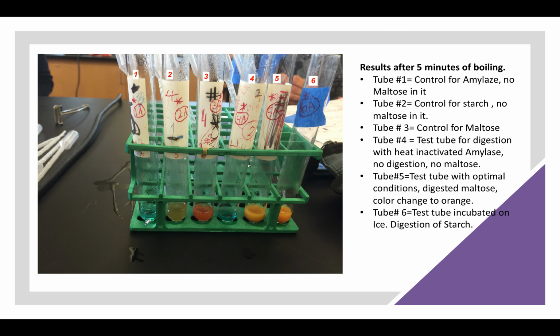No, unless there is contamination, which happens sometimes. Here there is no maltose in it. The normal color of Benedict's solution is blue, and here it stays blue. You put 7 drops of Benedict into the amylase, and it stays blue because there is no maltose.